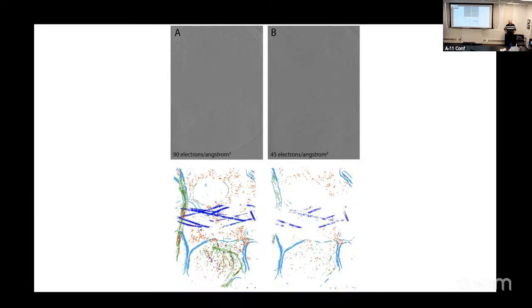Fine. What I would do, in that case, I would probably train a network specifically to do that. This neural seg was not trained to find filamentous or globular actin. But if you had tomograms where it was visible, we could train a network that would.